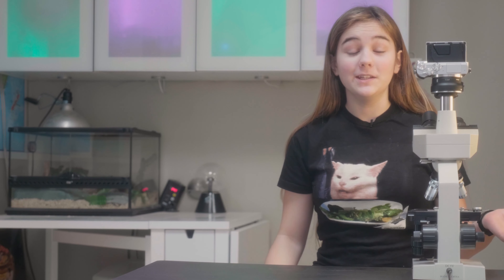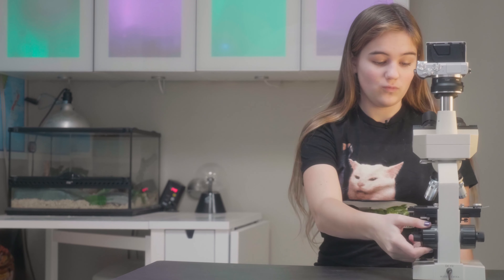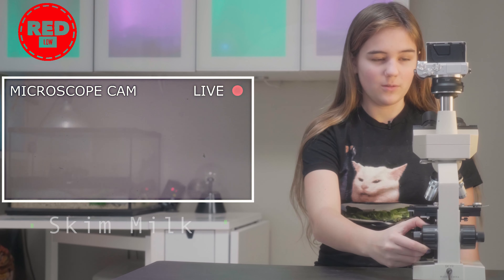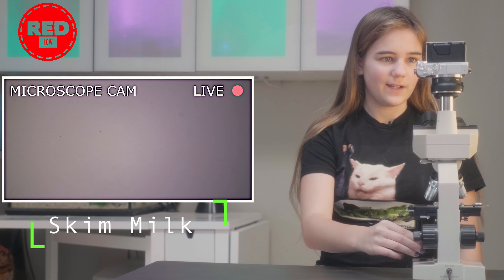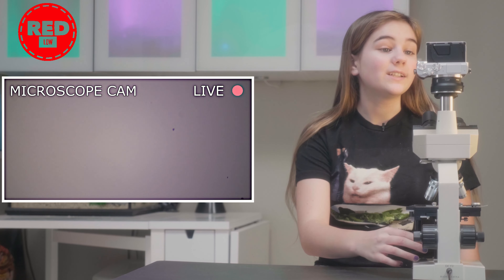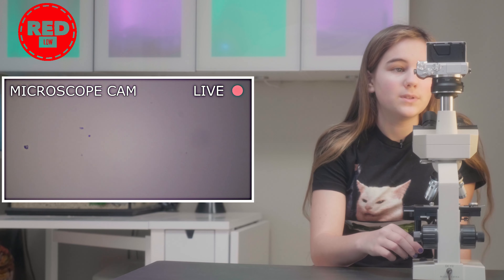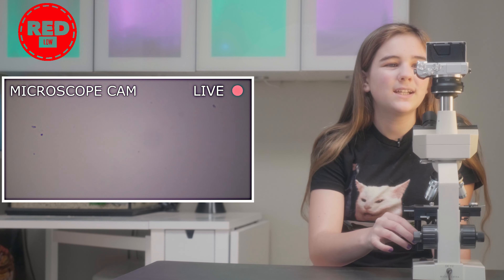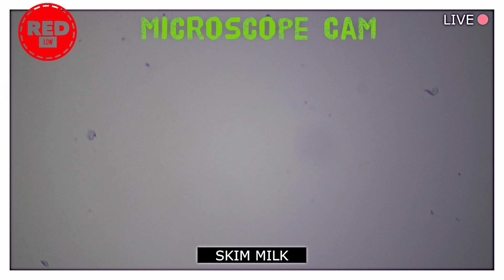We are back and we've got the milk on the slide already, so all we have to do is raise the platform and then we can look and see what we can find. Right now I don't really see anything. It just looks cloudy because the milk is clean. There are some little specks from time to time, but that is probably just because the slide was dusty. There's more stuff than I thought and there's this thing.